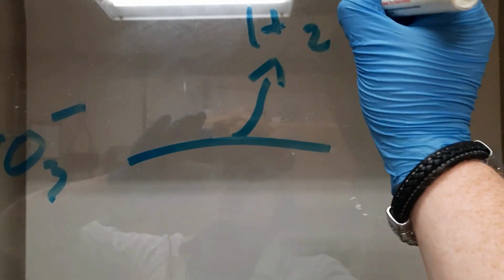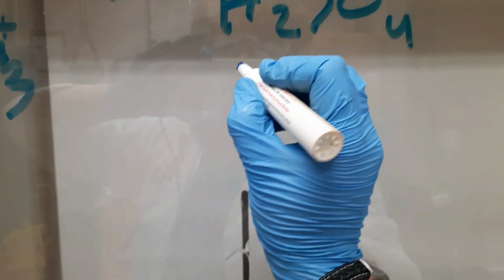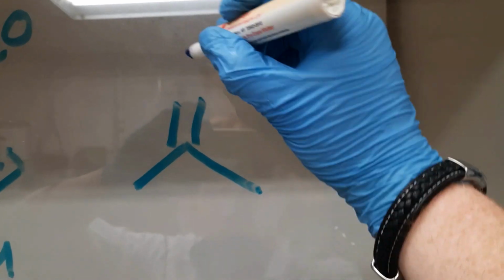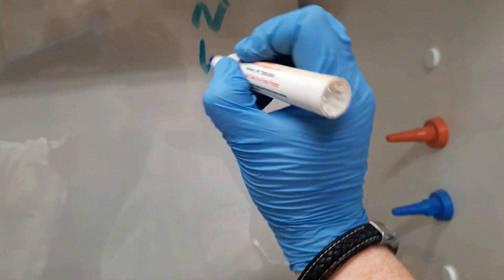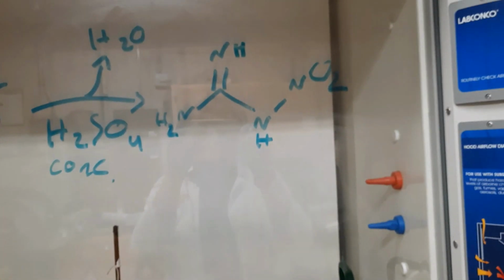So H2O, and this is in concentrated H2SO4, and we're making that.